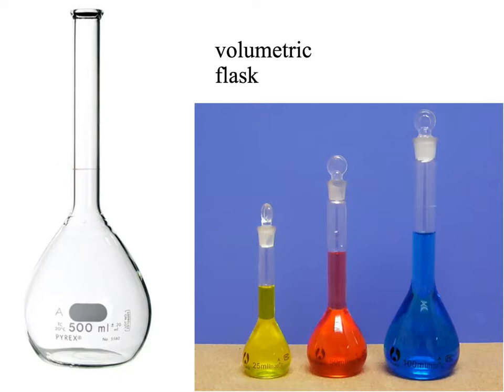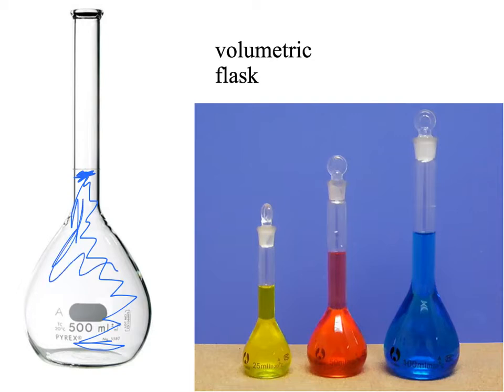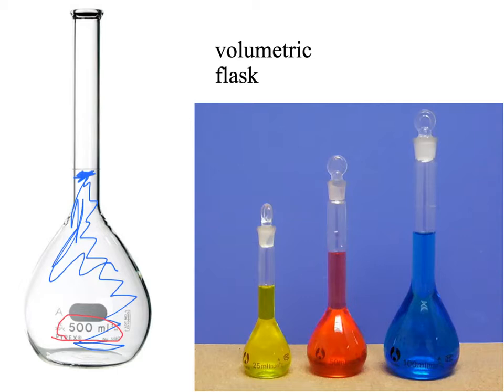If I fill this flask all the way to that line exactly, I would know that I have exactly 500 milliliters of solution in that volumetric flask, because these are calibrated to a very high precision — two decimal places — so I would know that I have 500.00 milliliters. Other sizes hold exactly 25.00, 50.00, or 100.00 milliliters. The function of a volumetric flask is to hold a precise amount of liquid.